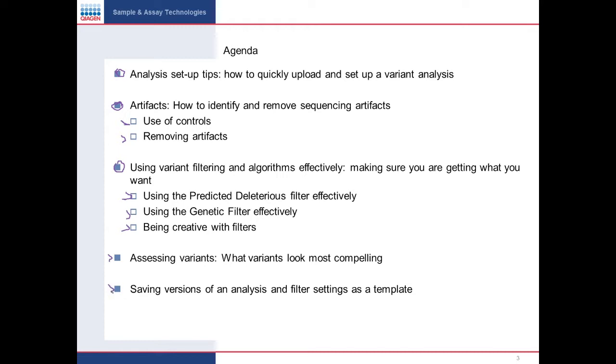And then lastly, a lot of people ask me, how do I save what I've done? Or if I want to do a forked analysis and ask separate questions, which is one of the things I actually encourage, how do I save each one of those off and have different versions? So we're going to talk about that. Another common one is how do I save my filter settings and reuse those filter settings, so we'll talk about that as well. There are some definite tips and tricks there.